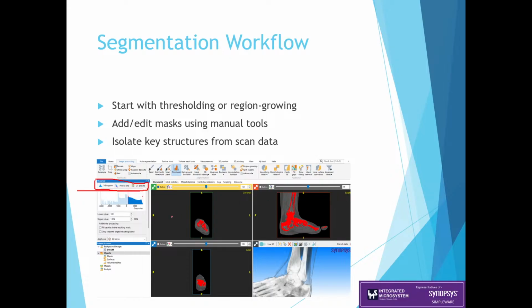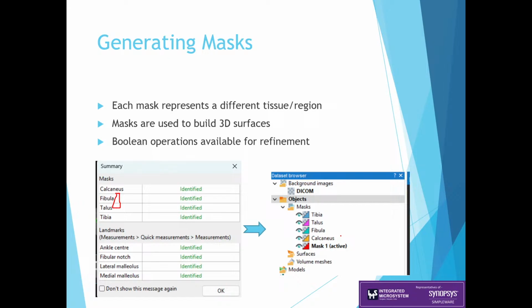Nearby muscular regions may lie in one particular grayscale range, then the skin might lie in another grayscale window. So there are multiple windows, and each peak represents a shift in the grayscale range. This way we can easily identify and distinguish the segmentation which is to be performed.